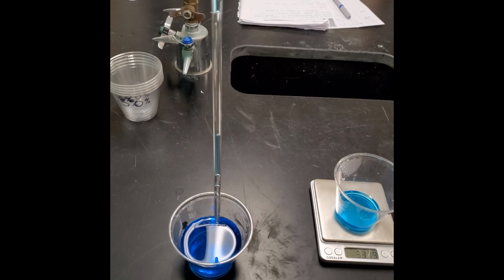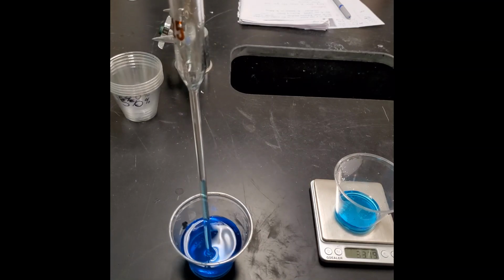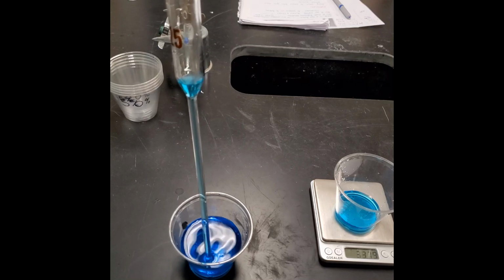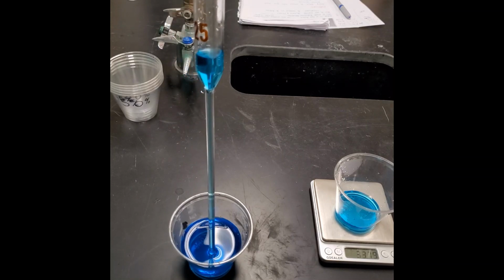That's really bad. You don't want any air bubbles. So what you're going to have to do is dial it down and force drain it into the sink so you can start over, okay? Then we dial it back up, but do not take it out of the liquid, otherwise you get air bubbles. That's very bad, okay? So I'm going to dial it up again.